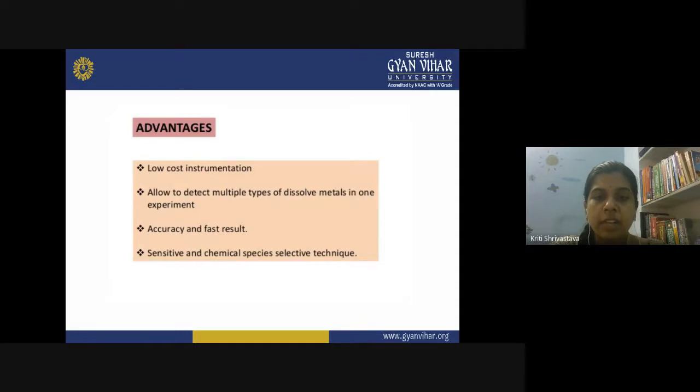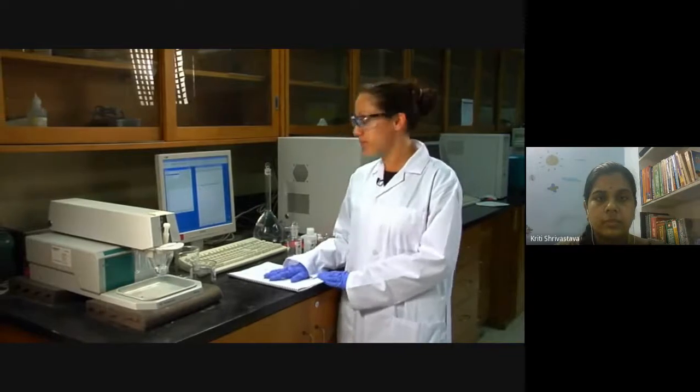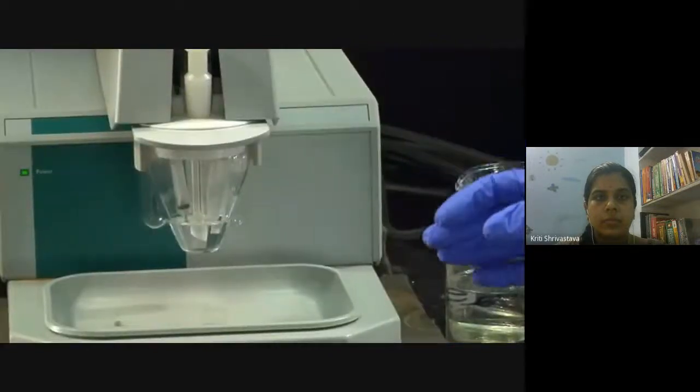Now we will see the experimental procedure. Today we're going to cover how to use DP-ASV — differential pulse anodic stripping voltammetry — which is a really good method for trace analysis of toxic metals usually found in the environment. We're going to be doing standard addition, which helps cover matrix effects. For river water or lake water with many other constituents that could interfere, this is a really good sensitive method.